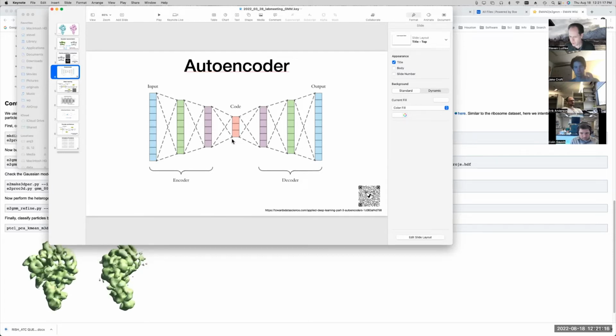So in an autoencoder, the network connection weights are basically learning the structure of the images that you're teaching it. So you put in not just one image, but a whole bunch of noisy images, and each noisy image you train. So it tries to make the output look as much like the input as possible, given the fact that it can only base its answer on the few numbers that are available here.